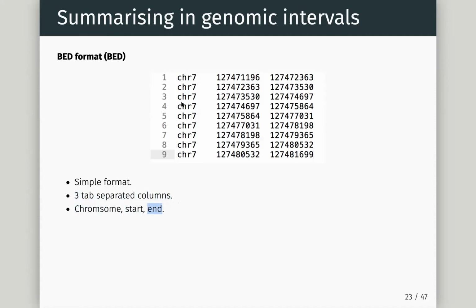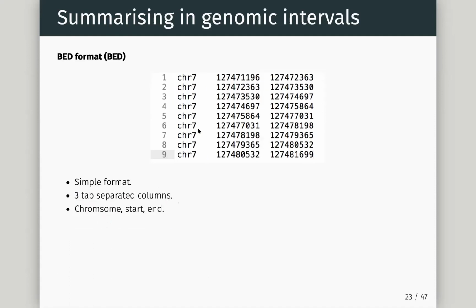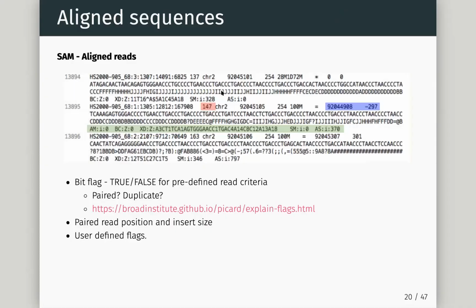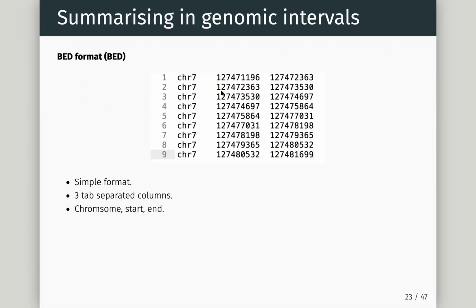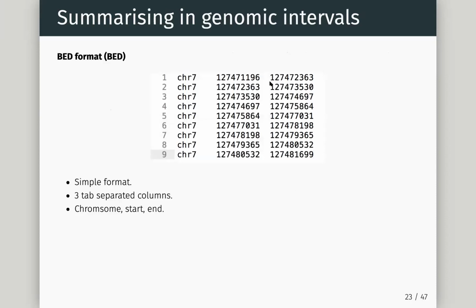Sorry, Thomas, this would be one, each row would be one of the reads for a particular region? So these are aligned reads. Yeah, for a particular area, right? Yeah, so the BED file doesn't need to be a read, it just needs to be any genomic interval when I want to have some information. Here are my TSSs, I could show that in this information. I could also simplify my reads to BED files, and people have, but it's a much simpler format, effectively.